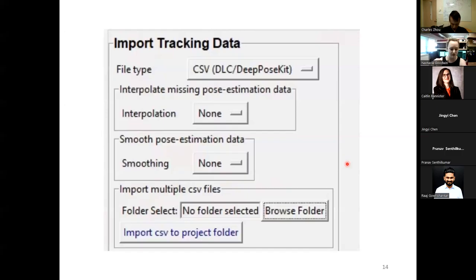You're definitely right that if you don't label any blurry frames, DeepLabCut will not recognize that as a mouse part. So you can choose your frames, but if there are some that you just can't label, you can skip those and then go back and try to fix it in outlier correction.